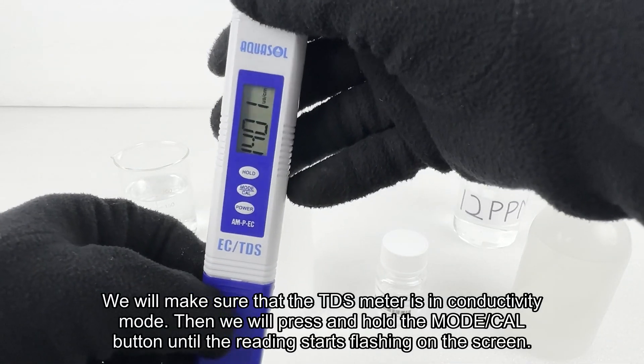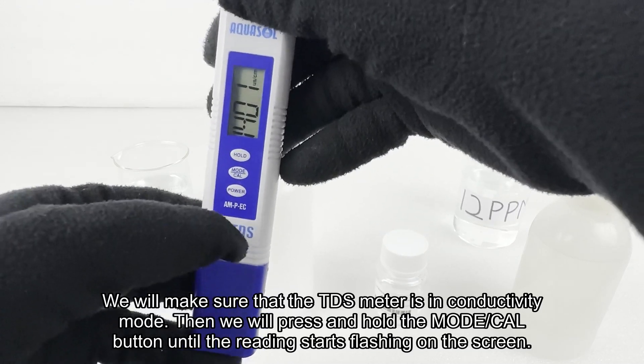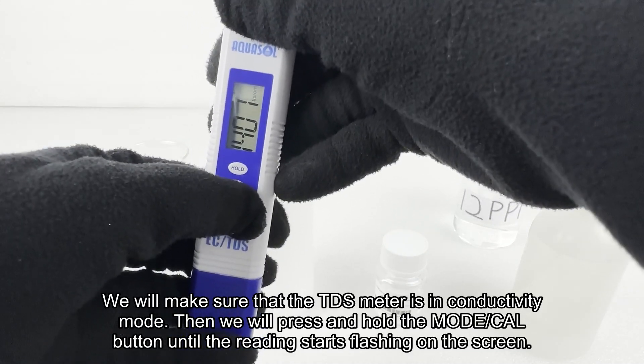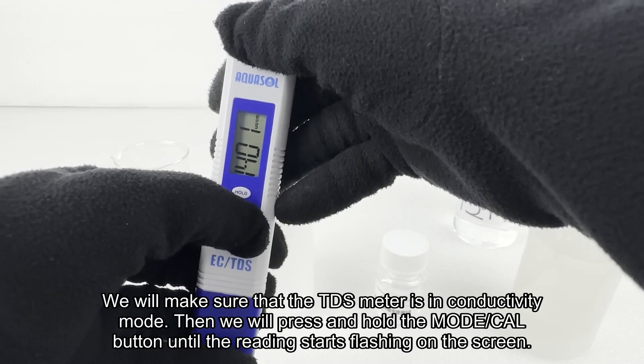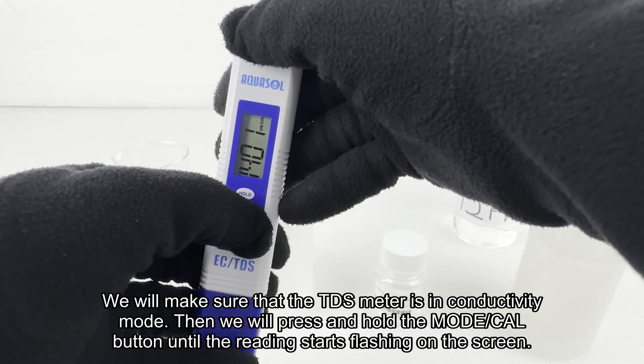We will make sure that the TDS meter is in conductivity mode, then we will press and hold the mode CAL button until the reading starts flashing on the screen.